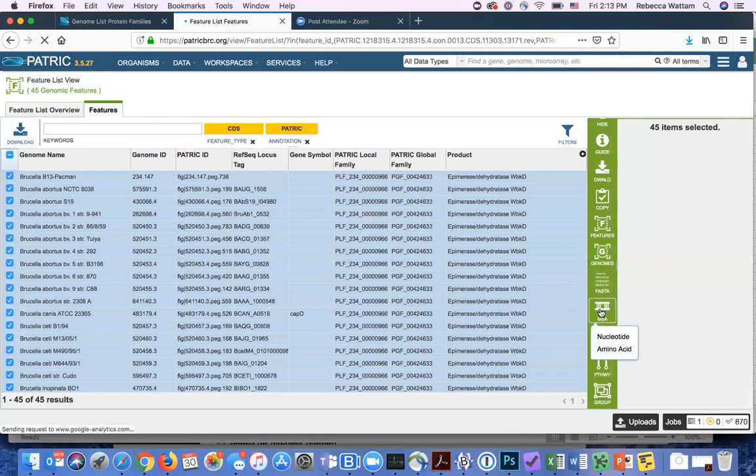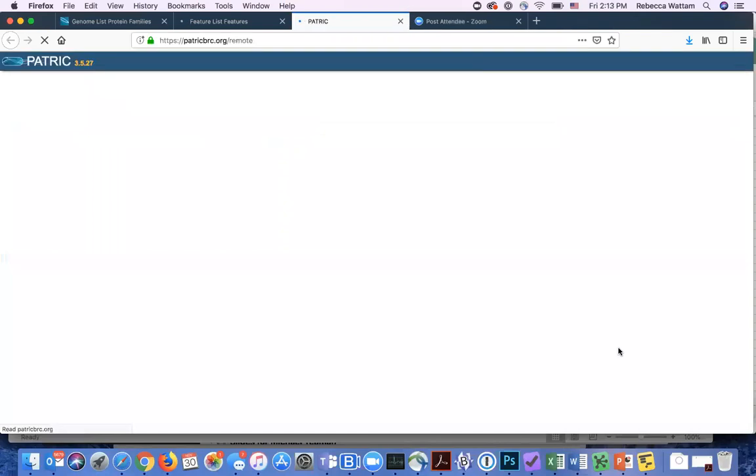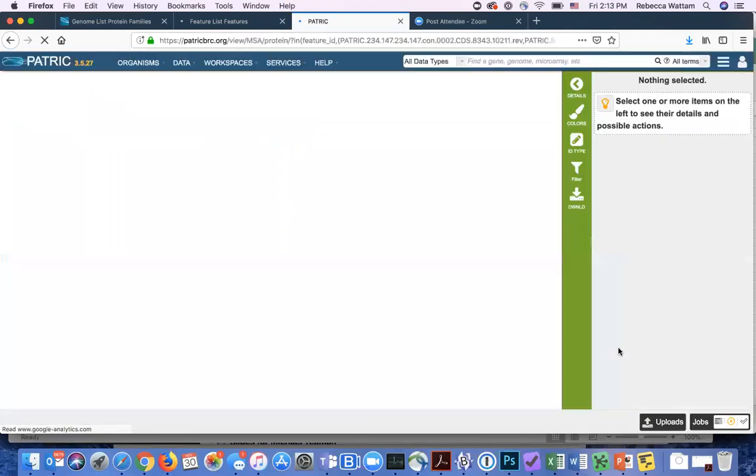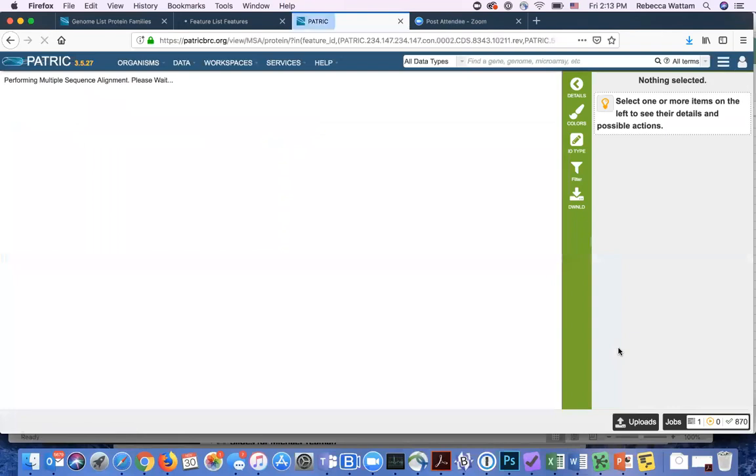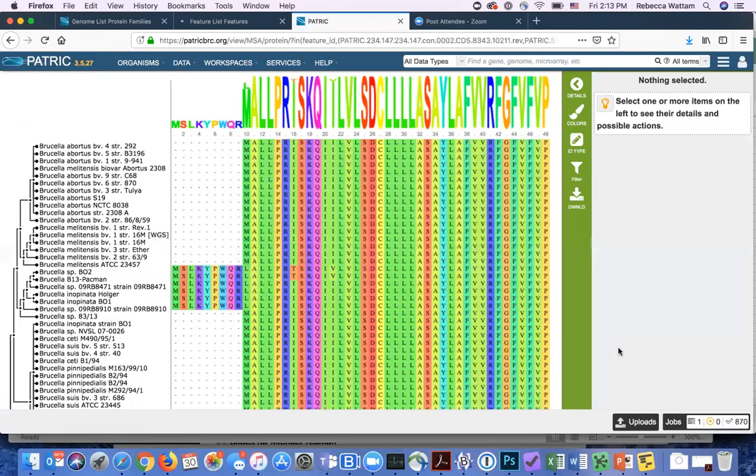I click on that and it allows me to choose between a nucleotide and an amino acid. I prefer amino acids because there are more of them and it looks better. Of course, if you want to do nucleotides, you should do nucleotides. But for demonstration, I want you to have a beautiful experience. And there you go.